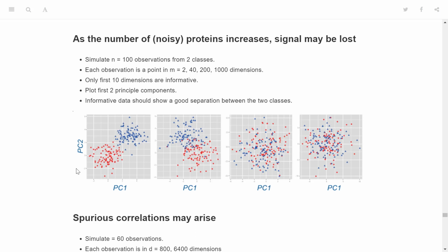Sample 2 has a low expression in P1 and P2, it appears here. So these are two proteins with single points. Here, principal component 1, principal component 2. On average, the distribution along the first principal component is low for one class, and high for the other class. So here we have good resolution.